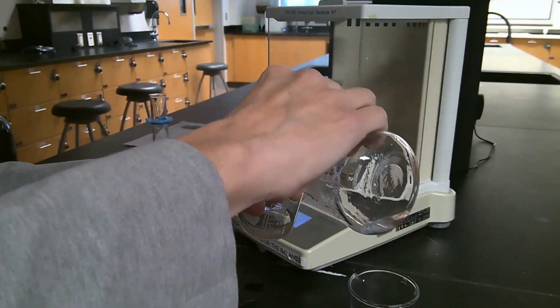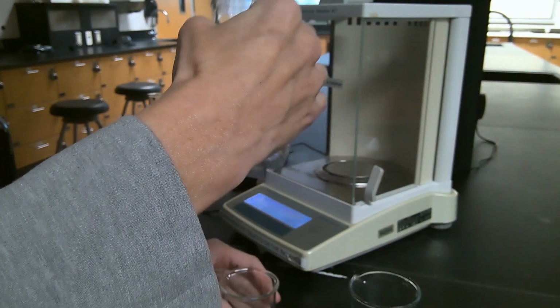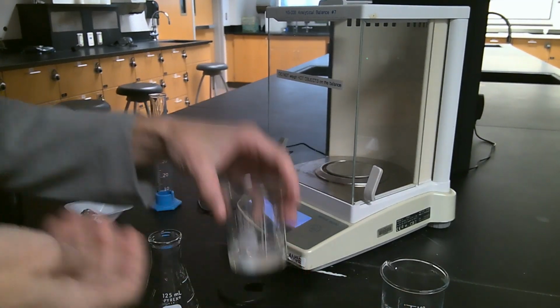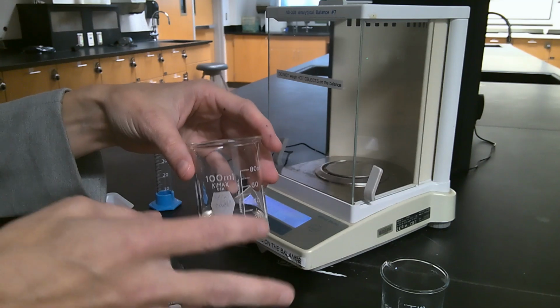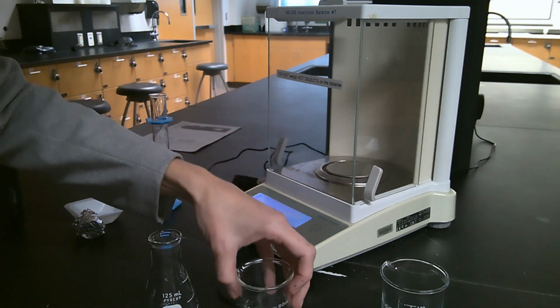And then I'm decanting that rinse portion of methanol into the beaker as well. So now this should just be the unreacted solid zinc. And in here is the zinc iodide product that we just produced, which is soluble in the methanol solution.